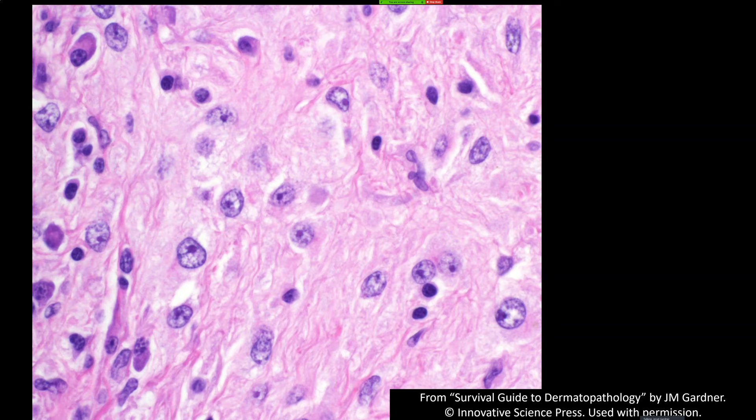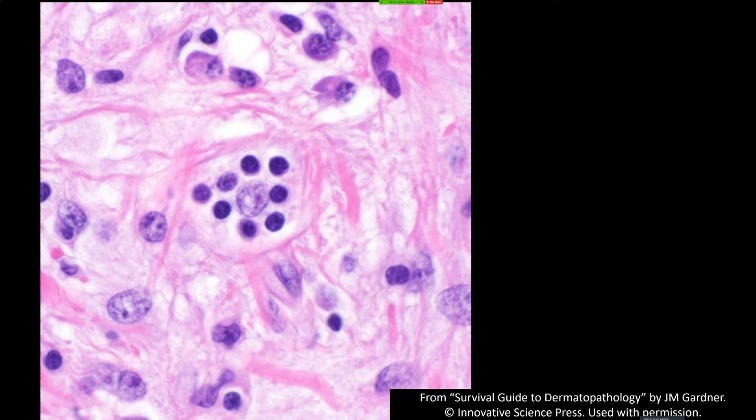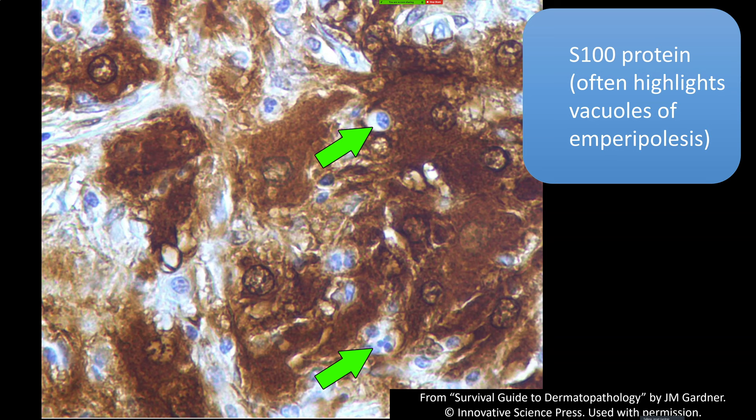Looking back at this slide, there is some emperipolesis — essentially everything you see here is histiocyte cytoplasm, so all the white blood cells are sitting inside the cytoplasm of the histiocytes. But it doesn't look as pretty as the pictures in books. You really don't need it to make the diagnosis in my opinion. Also, other things can show emperipolesis — juvenile xanthogranuloma does sometimes, and I've seen sarcomas and other things with white blood cells in their cytoplasm.